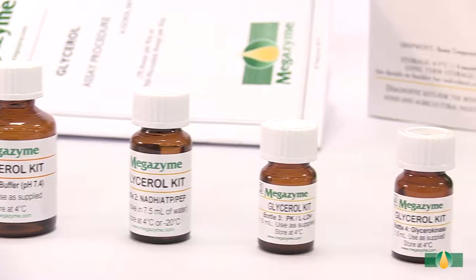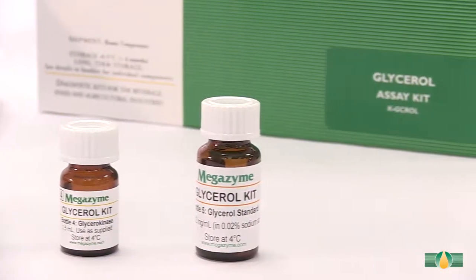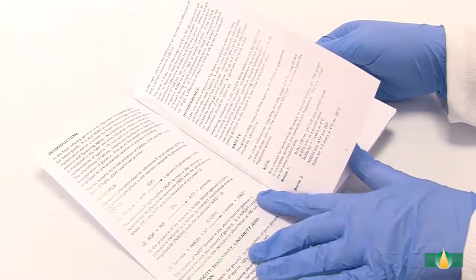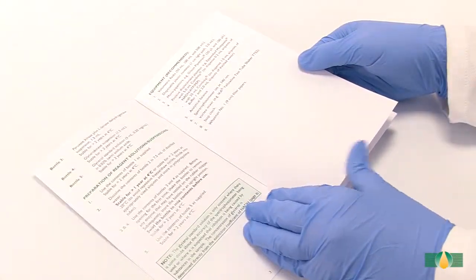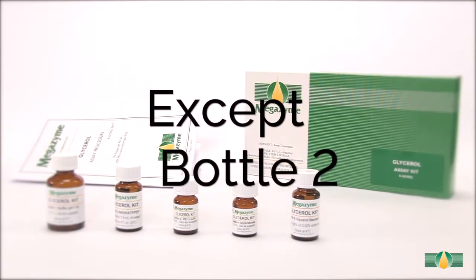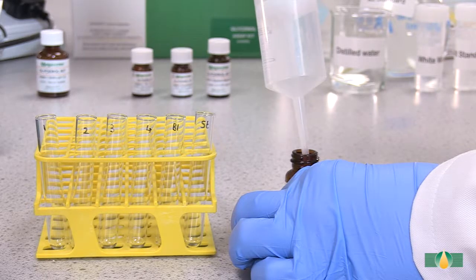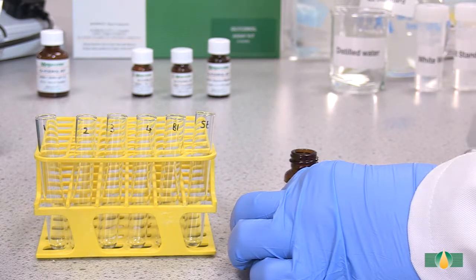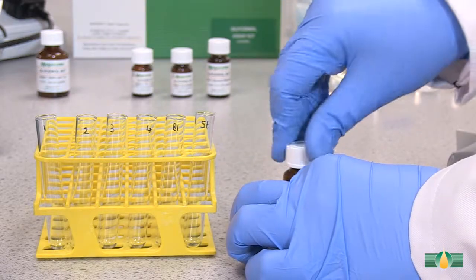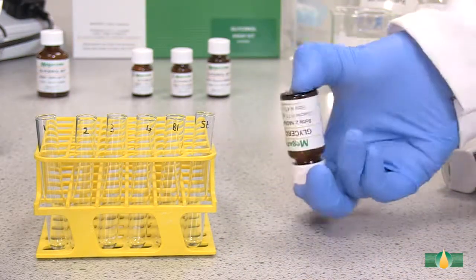Prior to sample analysis, the kit components should be prepared as described in the kit data booklet, and once prepared they are ready for use in the manual assay procedure. All of the kit components except bottle 2 are used as supplied. The contents of bottle 2 are dissolved in 7.5 millilitres of distilled water. The bottle is capped and the contents are mixed thoroughly to ensure complete dissolution.